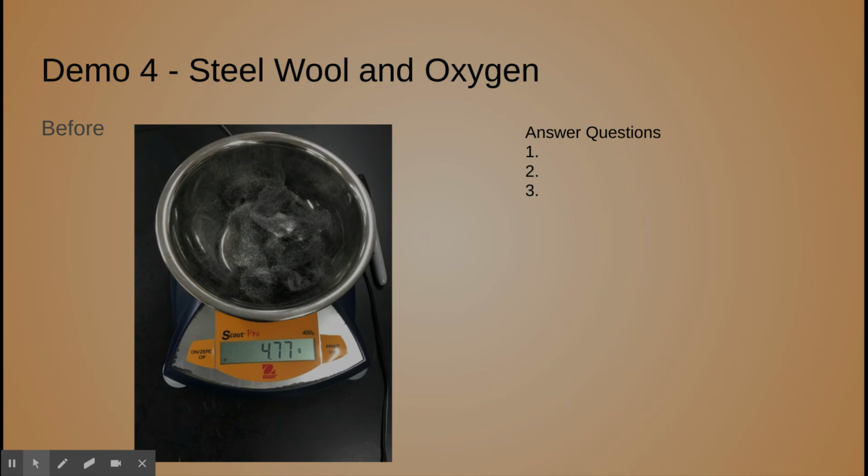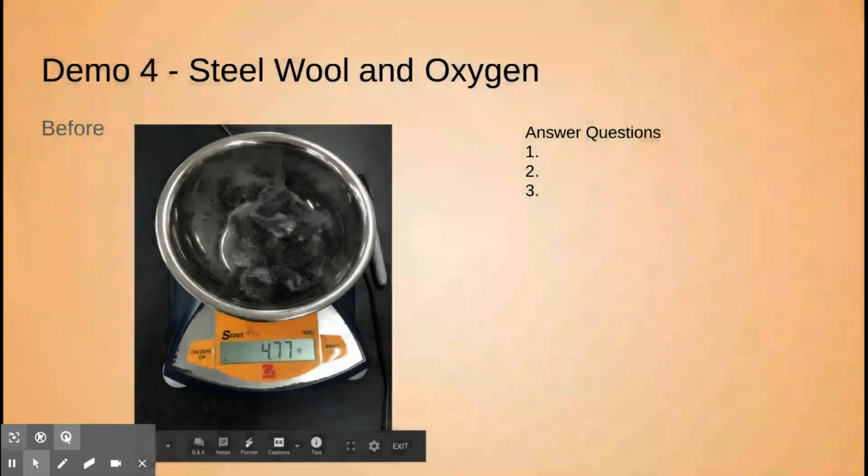In number 2, your observations are going to be looking around you. So for number 2, oxygen is the other substance we're going to use, and oxygen is in the air all around you. So you can write down again state of matter and color, because we'd seen earlier that gases can have colors. We had that iodine gas in the very first one. So writing a color with your gas does make sense. Okay, so here we go.